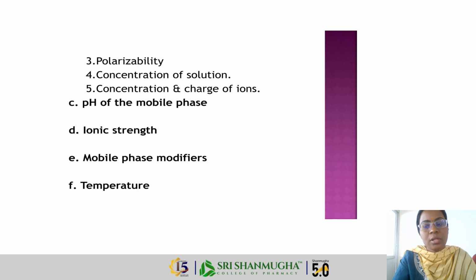Concentration of solutions may be liquid or percentage, and concentration of charge of ions means positive ions are more than negative ions. Then the pH of the mobile phase: when we change the pH of the mobile phase, it affects the ion exchange chromatography. Then ionic strength, mobile phase modifiers and temperature. Increasing or decreasing the temperature affects the ion exchange chromatography.